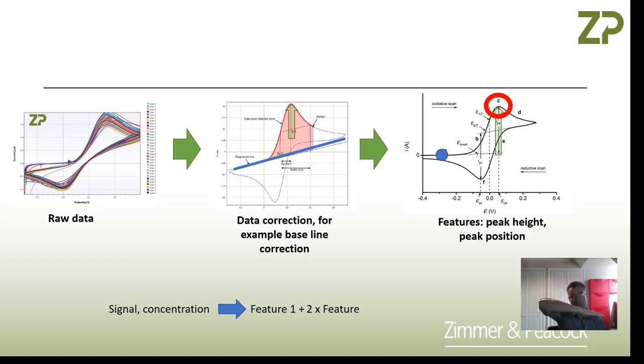Now, in electrochemistry, sometimes the baselines are flat, sometimes they tilt, and sometimes they move from experiment to experiment. So you have to be aware of it and know how to do an extrapolation from a region and create the baseline. Sometimes you can't just take the absolute peak height, you have to take it relative to a baseline. And if the baseline is shifting, you have to know about it and compensate for it. So the message here is we gather raw data, and sometimes we have to correct the raw data.